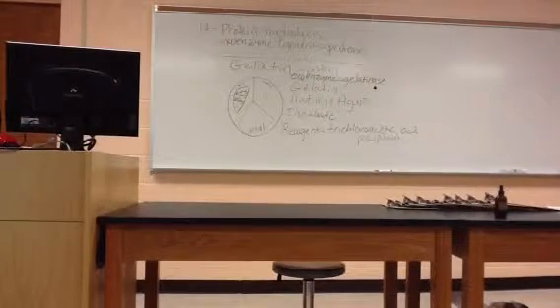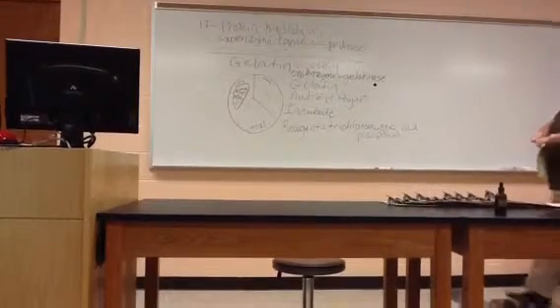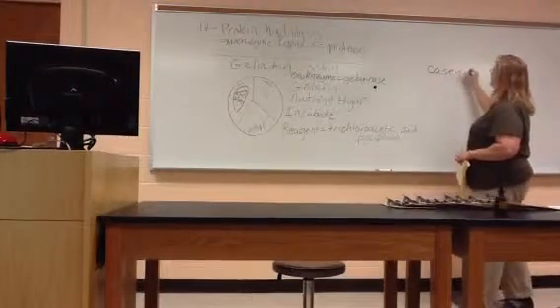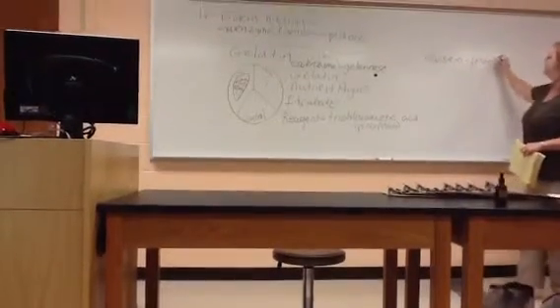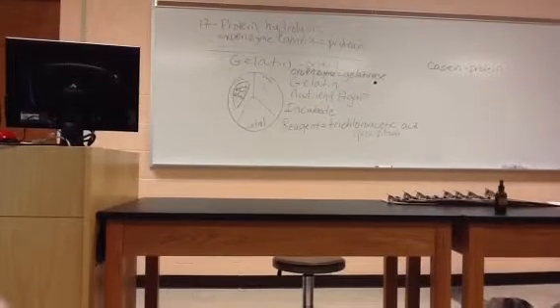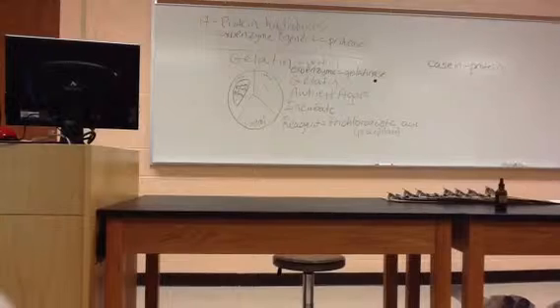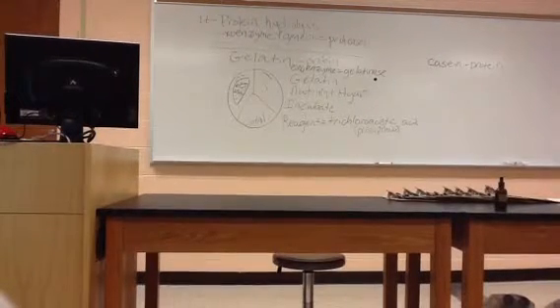Still in Lab 17, we're going to look at a second protein now. So gelatin was one. The second protein that we're going to look at is casein. And this is the protein in milk. Excuse me, thank you. Protein in milk. It's what gives milk the white color that milk has. It's because of the casein protein.